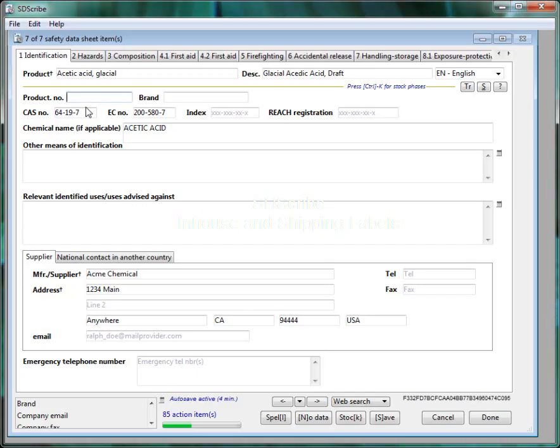I'd like to show you how to create both in-house GHS end-user labels and also shipping labels. We'll do it for the example of Acetic Acid Glacial.